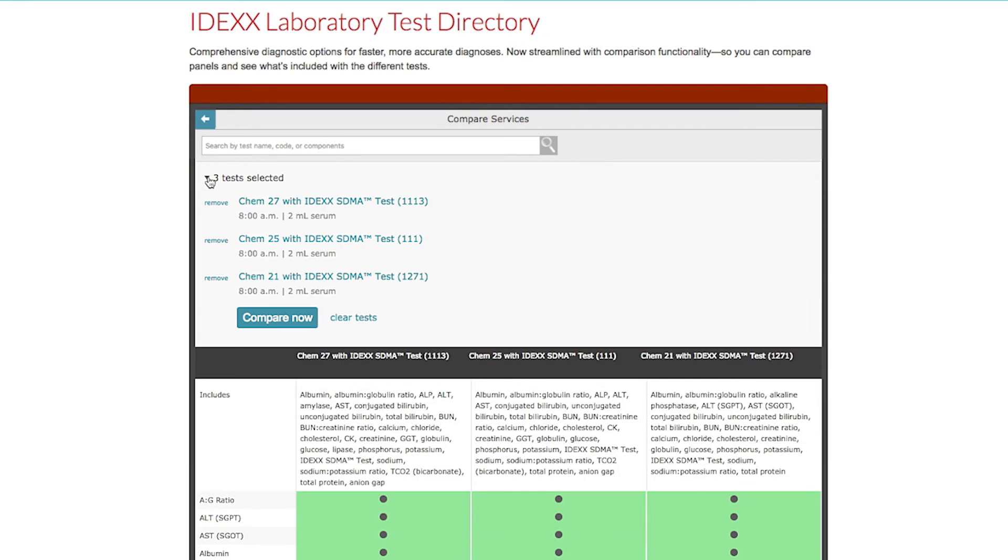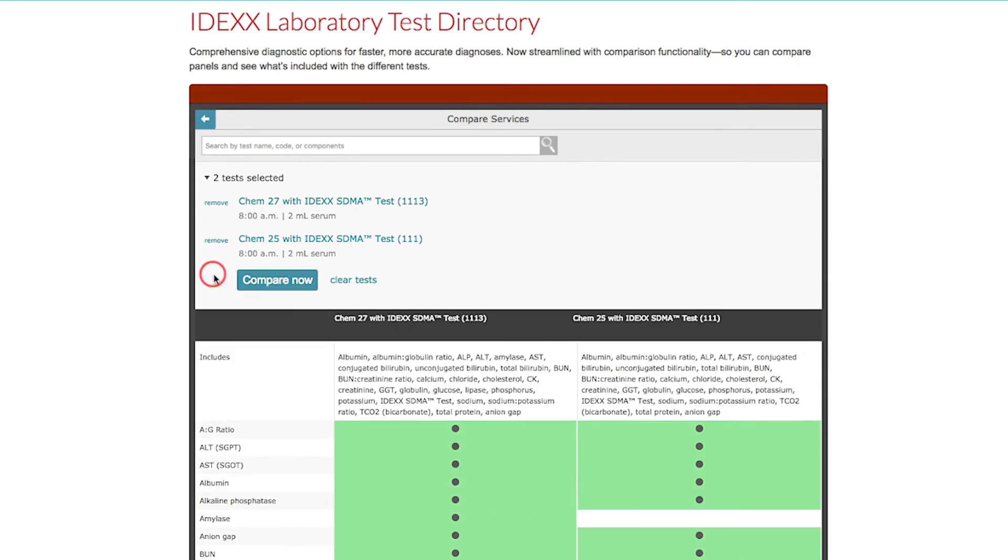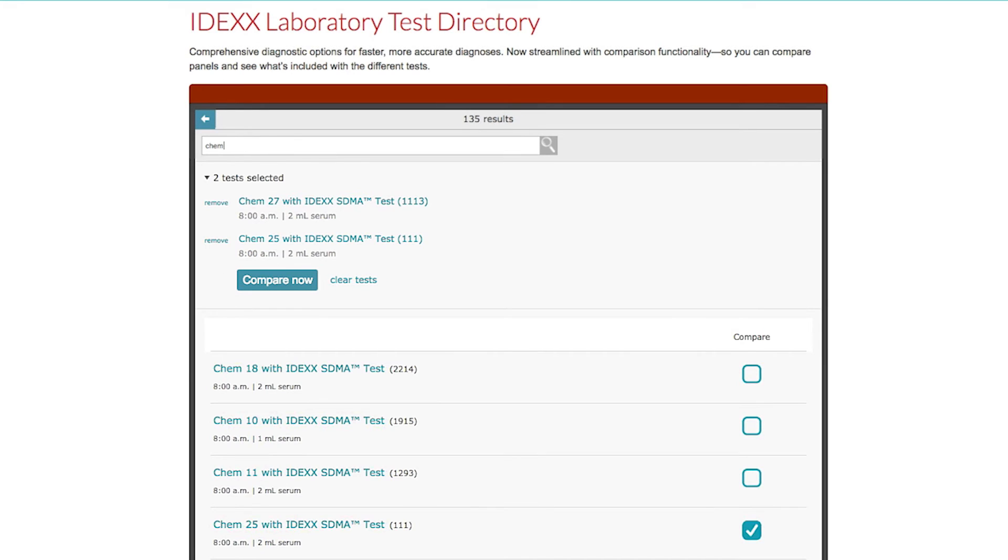You can continue your search by using the remove button to remove a test and then search again to add a different test or tests.